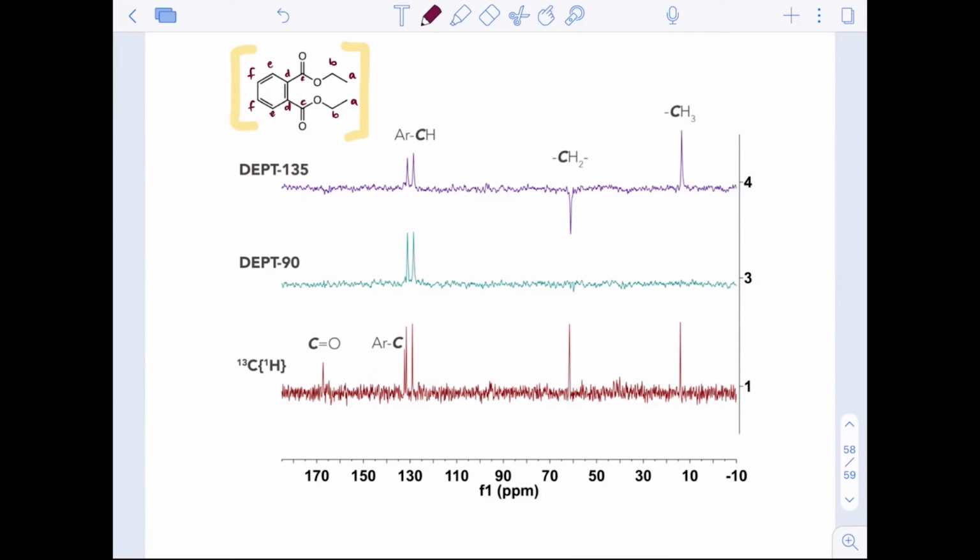And so we should see 6 peaks. But what's really important here is the idea of a couple of these that we see. The aromatic CHs are kind of shoved in here, and aromatic C for carbon D is a little hard to see as well. But we'll try to elucidate these 6 peaks as much as possible, okay?